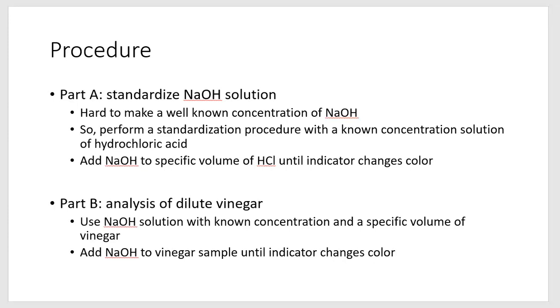And therefore, when you measure out the solid sodium hydroxide, you don't know if you're just weighing out sodium hydroxide or if you're weighing out carbonate impurities or water. And therefore, you can't trust the mass of the solid sodium hydroxide real well. It's a little bit uncertain.